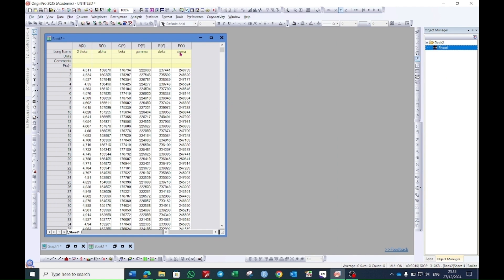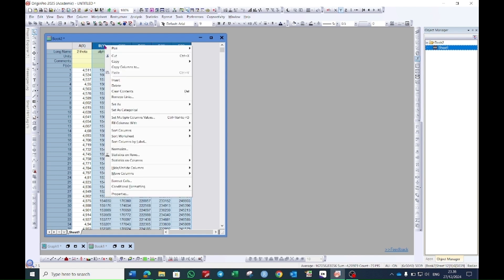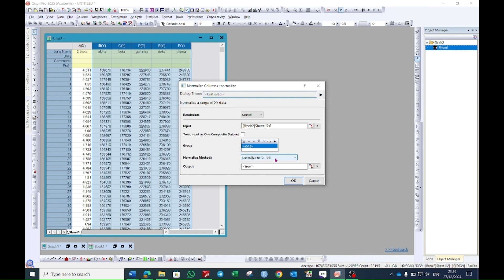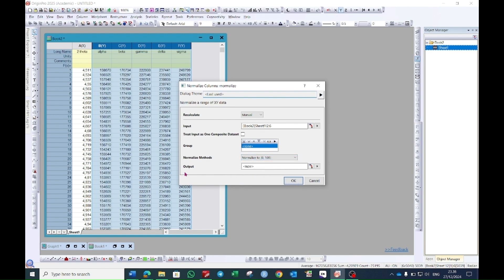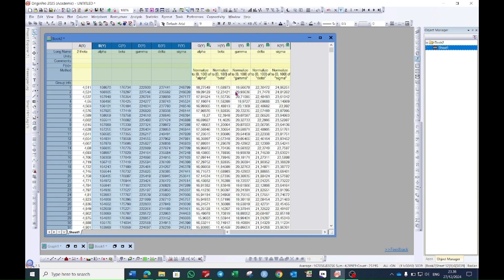To convert these values into normalized form, select all of the columns, right-click, and you will see an option which is 'Normalize' — select this one. A box will open; here you will see a normalization method which can be from 0 to 100 or other options as well. To choose 0 to 100, make sure the output is set to 'New' and then press OK.